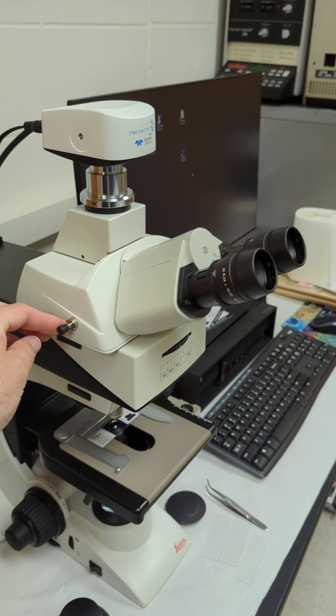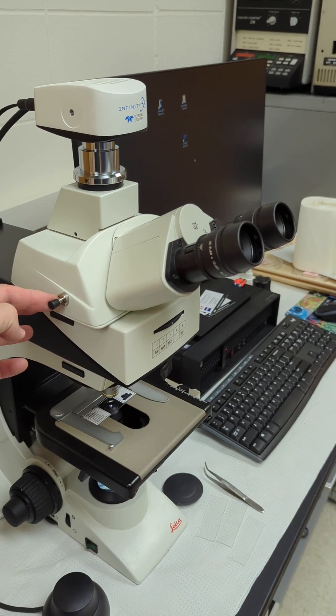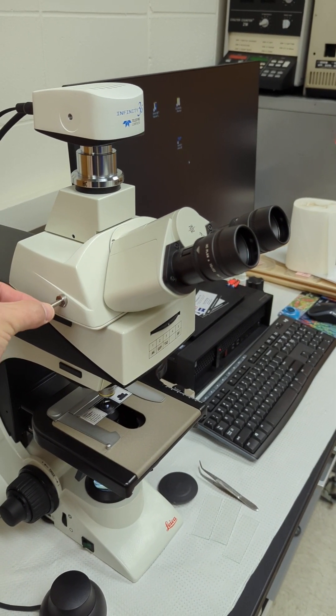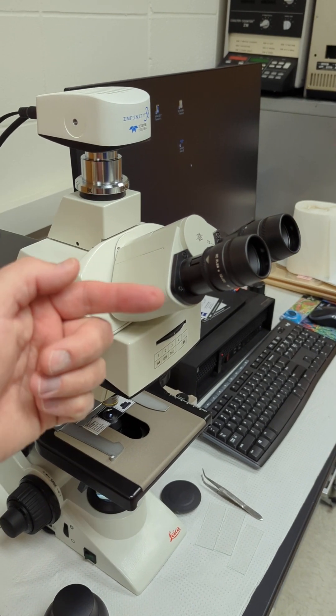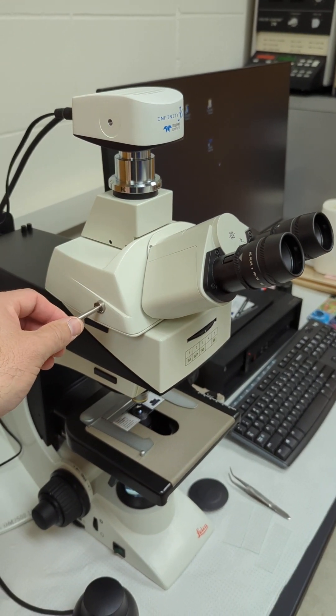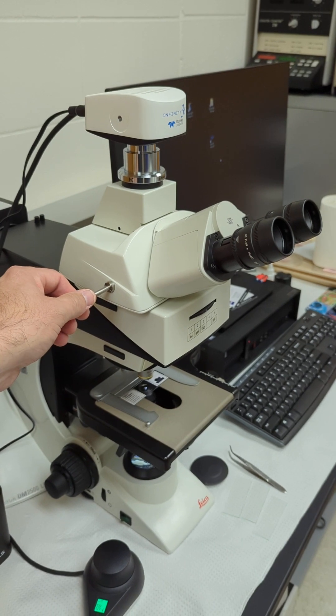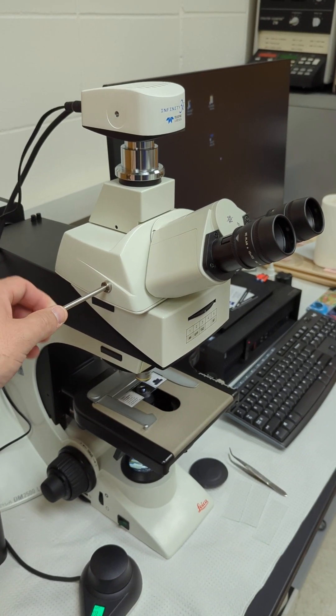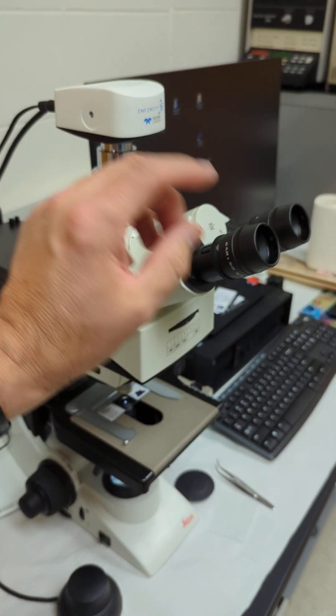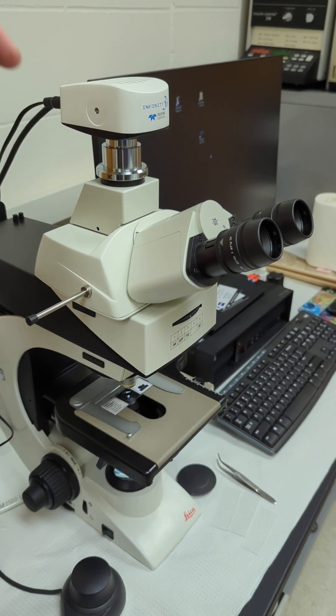This plunger, when it's pushed in, is all eyepieces. Halfway is 50% to the camera and 50% to the eyepieces. That's 50% of the light. And then all the way out, you'll see no eyepieces and all camera.